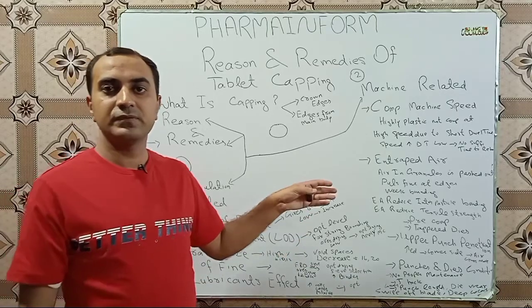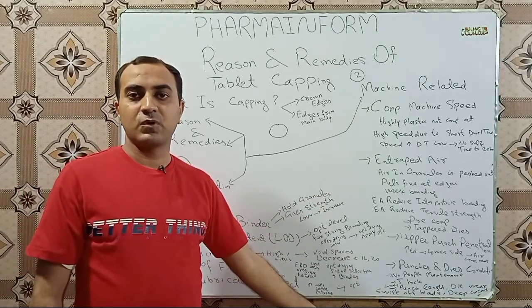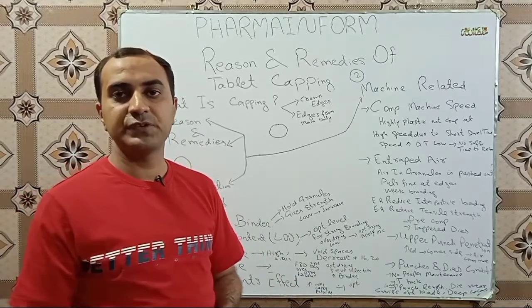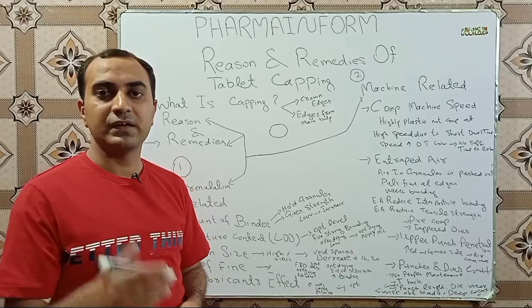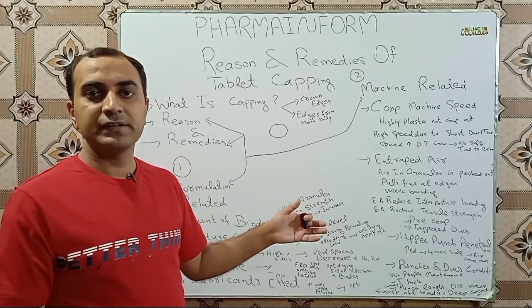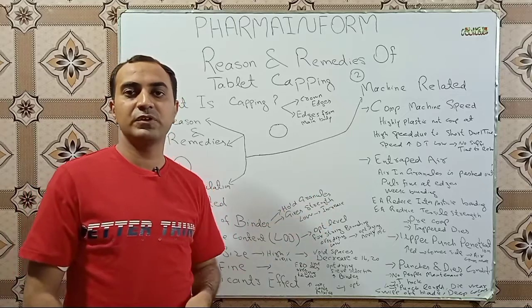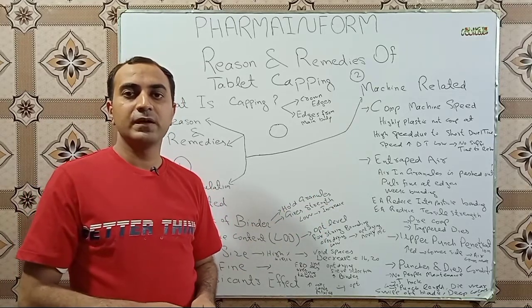To solve this problem, we simply have to apply or moisten our granules. How to apply the moisture to our granules is a separate topic we will discuss in separate video.